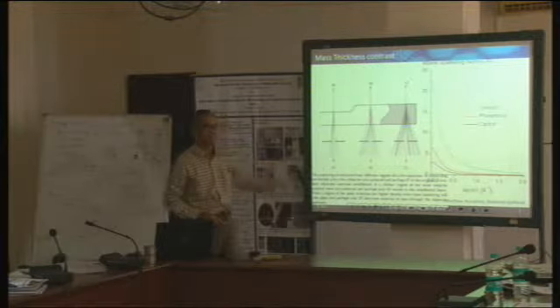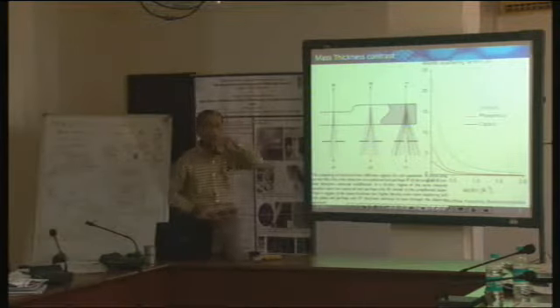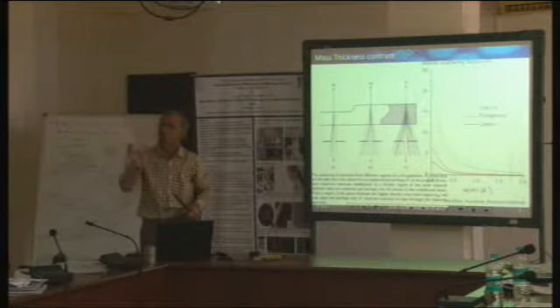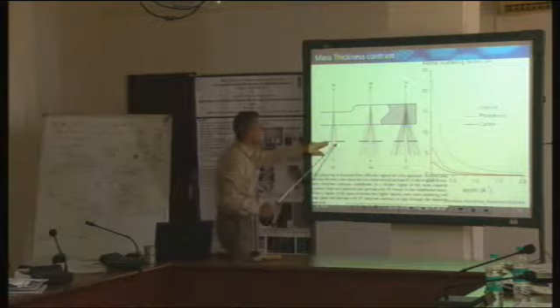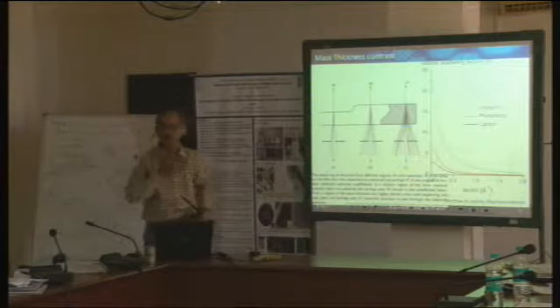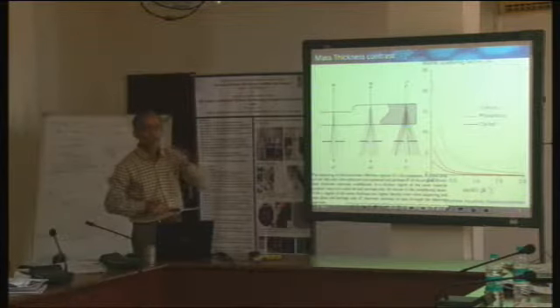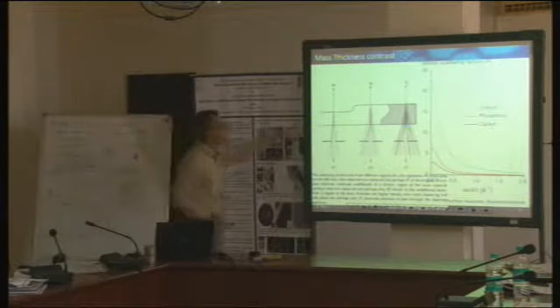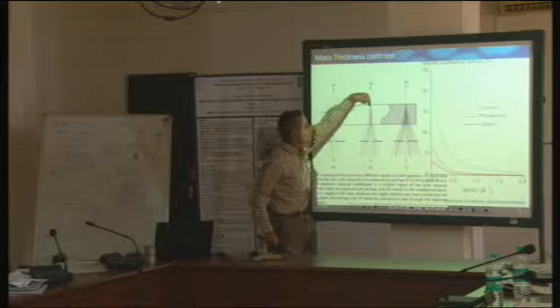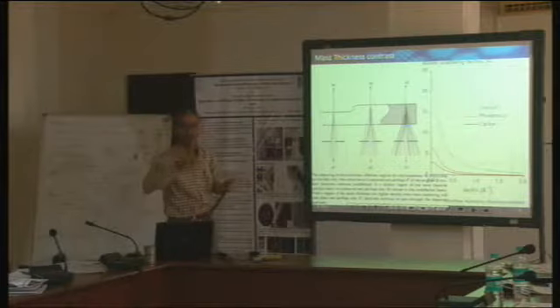And what we said is that this is bright field microscopy. And we said that we will allow the zeroth beam to go through, or the beam which is scattered in the forward direction primarily. So we have put our aperture, and here please don't get confused in the following way. This is a little bit confusing, so let me clarify right from the beginning. We are actually talking of bright field imaging where there is parallel illumination. So this schematic diagram tends to make you think that the beam is falling here, then it is falling here, then it is falling here, like that. But please, this is just for the sake of understanding.